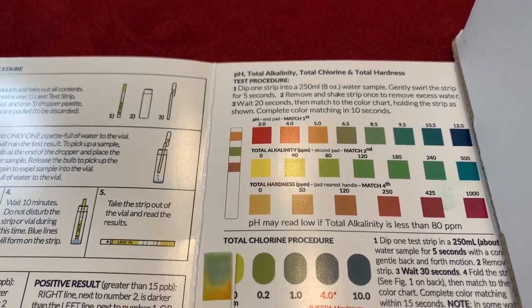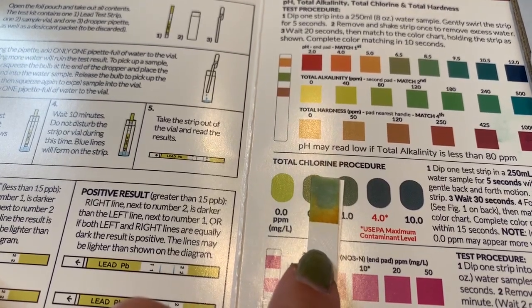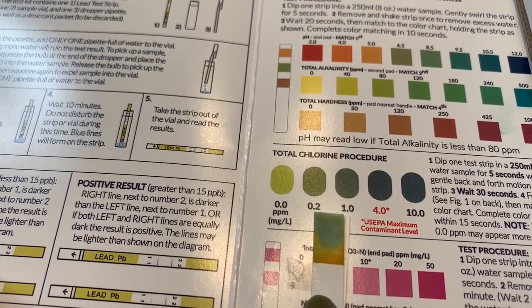Total chlorine — perhaps somewhere around here. So somewhere between 0.2 and 1.